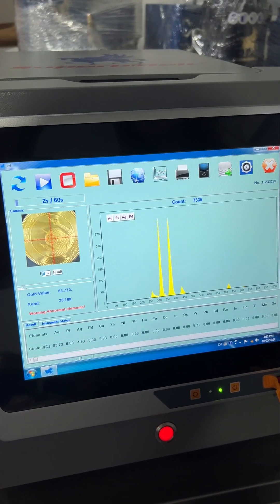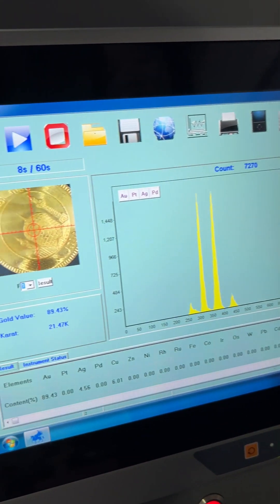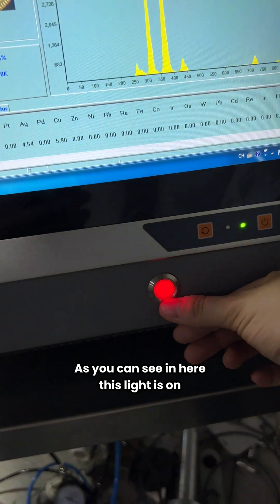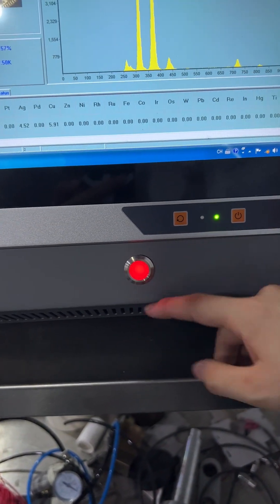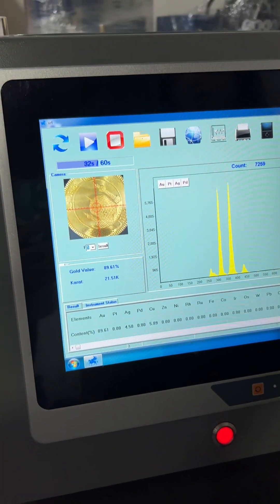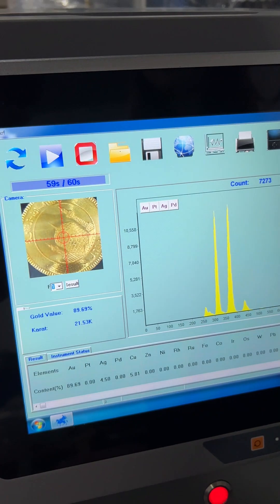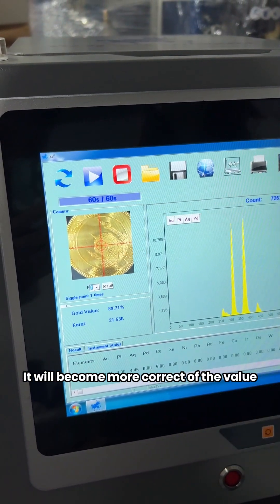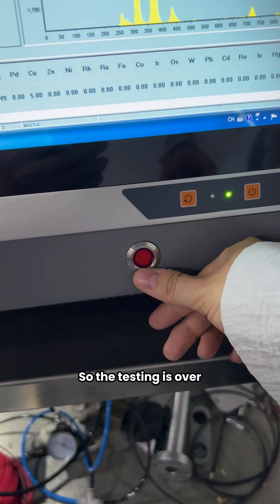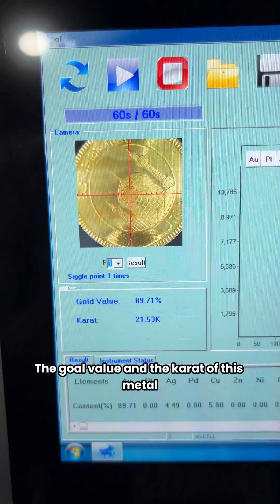The machine is testing now. When the machine is testing the metal, as you can see, this indicator line is on. After the testing is over, this line turns off. As you can see, this value is changing with the measurement and will become more accurate. When the light is off, testing is done — we can read the gold value and the carat of this sample.